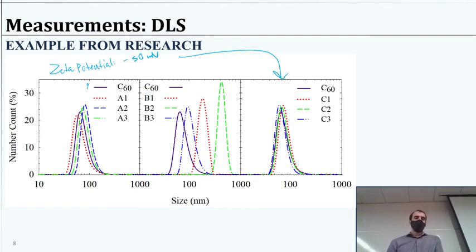Now these ones here were positively charged, and in fact, these were fullerene aggregates in water. So these ended up forming the negative charge, these as well. These guys had something like plus 10 millivolts. These ones maybe plus 20 to 30. And, oh no, sorry, wrong one.